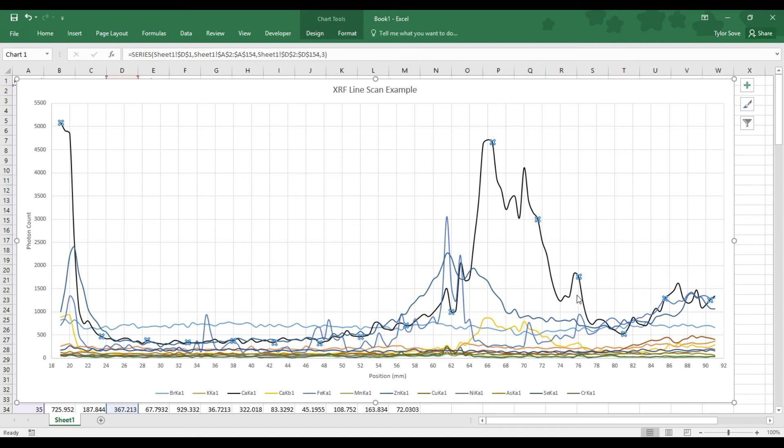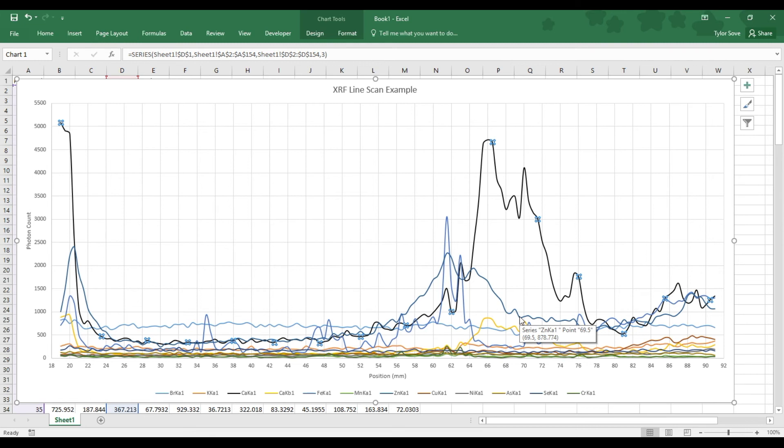we see that zinc kind of does the same, but it doesn't oscillate nearly as much. In fact, we might be able to attribute some of that oscillation to just the noise within the data, as we can see it is fairly noisy.